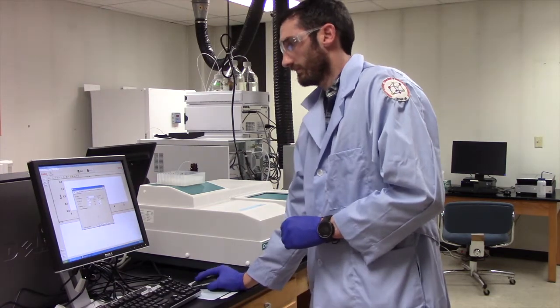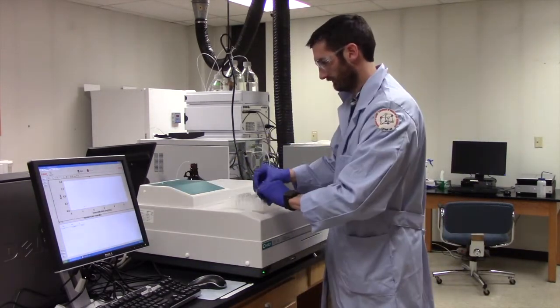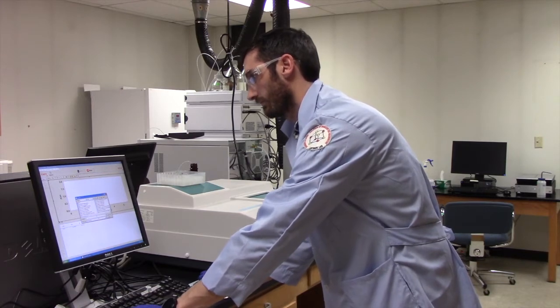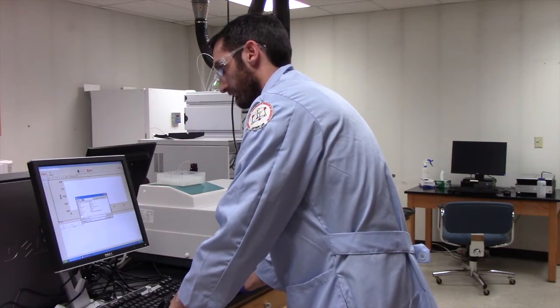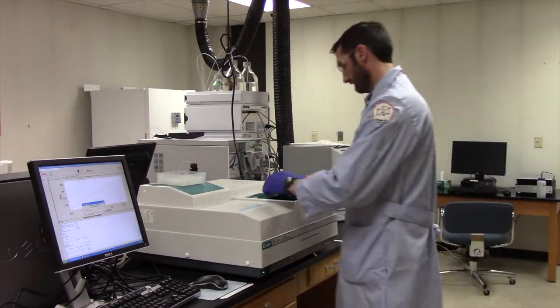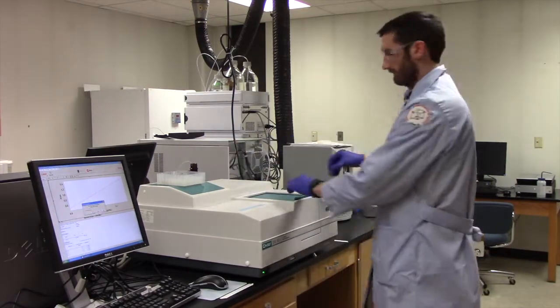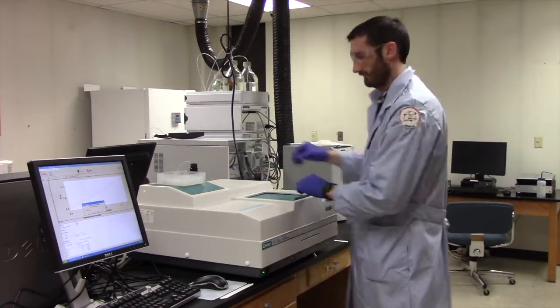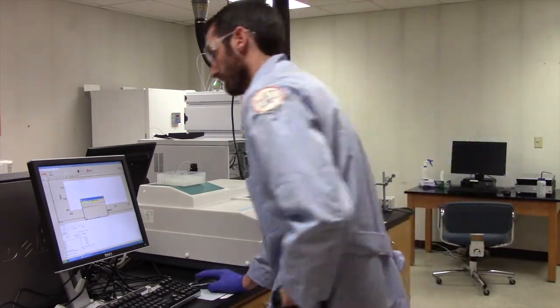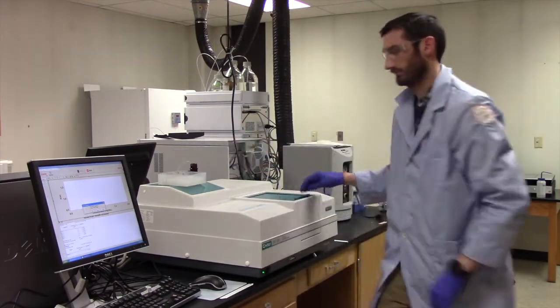Set up the spectrophotometer according to your TA's instructions. Blank the spectrophotometer using water in a cuvette. Next, measure all protein standards and record their absorbances. After you have recorded the absorbances for your protein standards, record the absorbances for your protein samples.